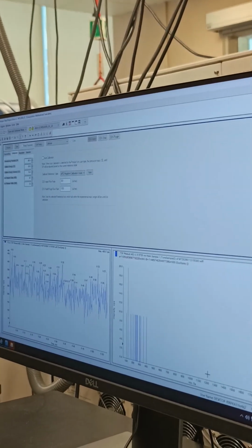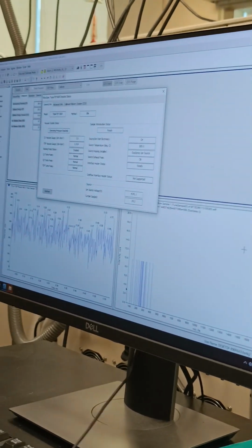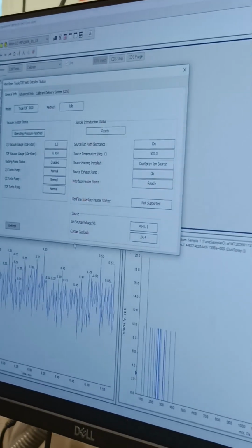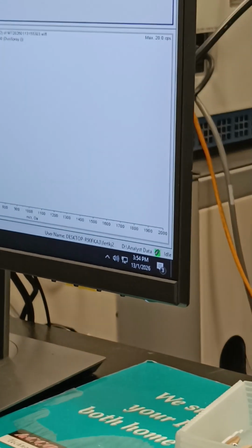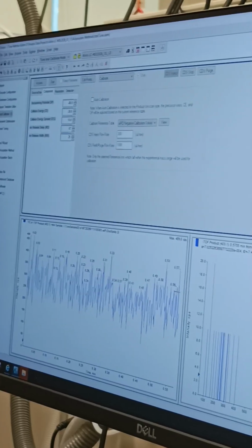And if you ever notice this icon here, this one actually reflects the condition of this MS machine. If it's green light, it means everything works well. Every time I encounter some problems, this one will become red, and then you can check from here. All the voltage, as long as you see the reading is fluctuating, then it means normal. If it's not fluctuating, then there's a problem. As long as green light is fine.